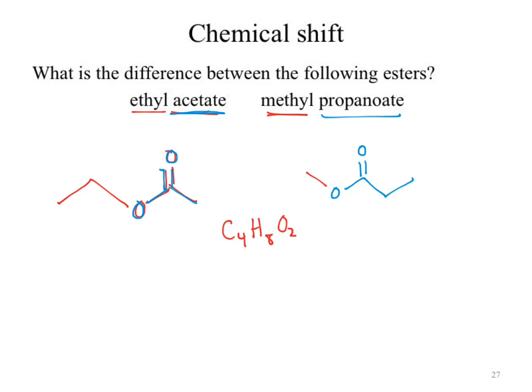If we broke down now and looked at the chemical shifts, the splitting patterns, multiplicity, all of that. So let's now break that out. How many hydrogens should show up for that position? 3 hydrogens, because there's 3 hydrogens at that position, right? And the last one?